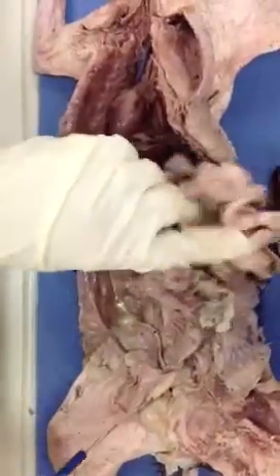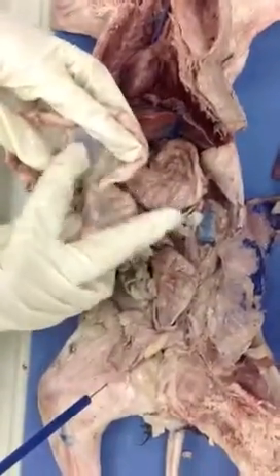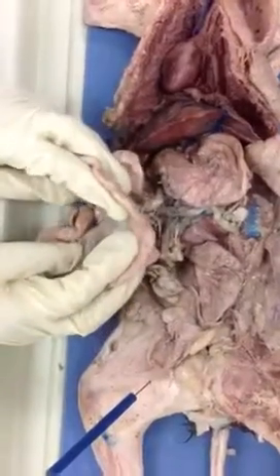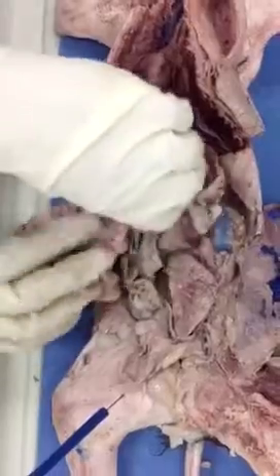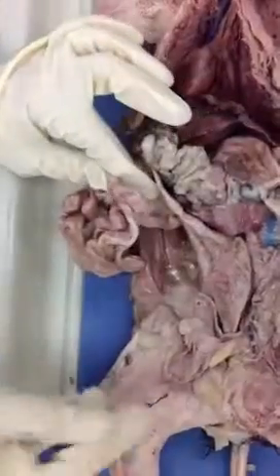Very good. Now I'm going to encounter another mesentery. What's the name of this mesentery, please? What does it anchor, please? It anchors the jejunum and the ileum to the dorsal body wall. There you go. Very good.